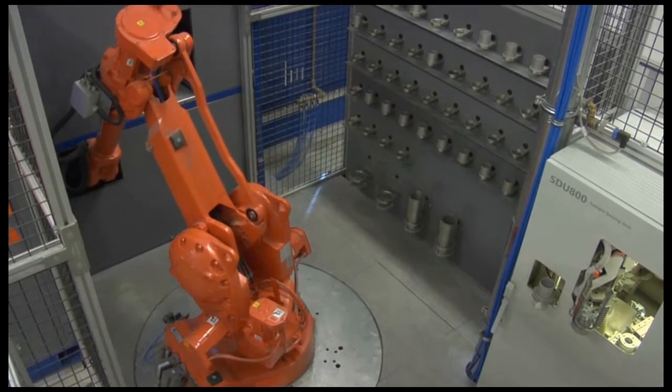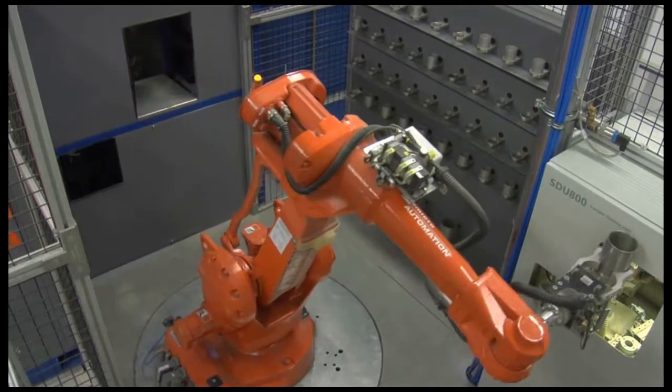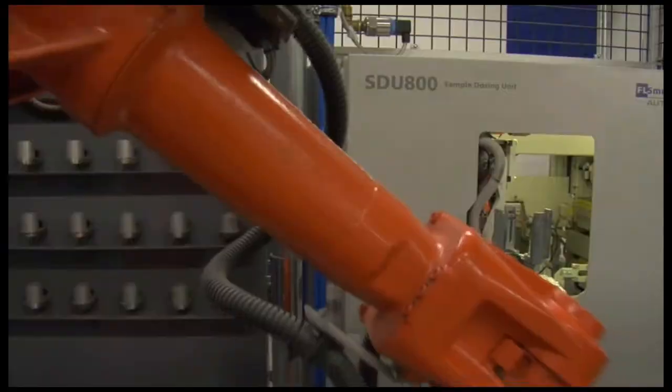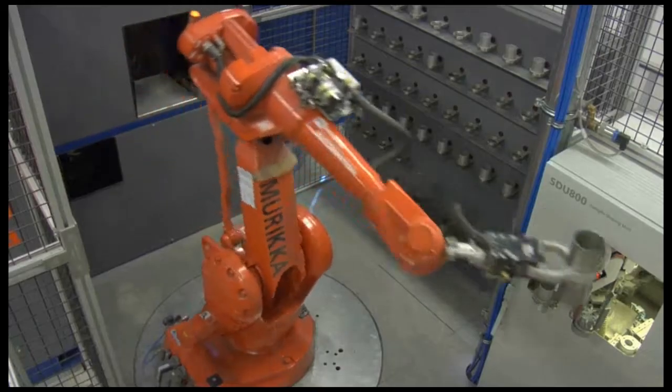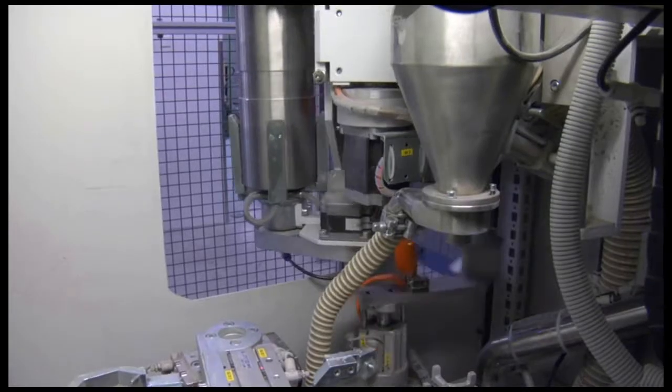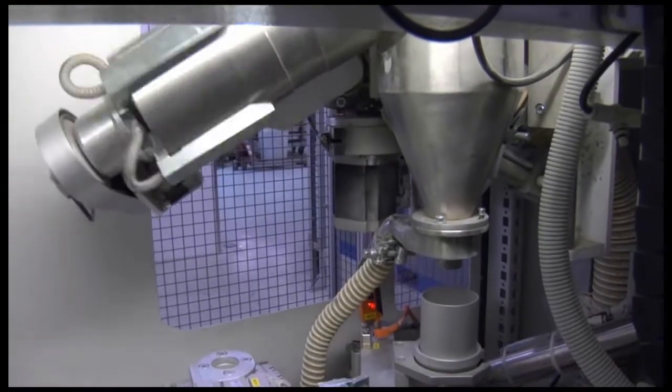The sample portion coming from the pulverizing cell is split into a large cup in the sample dosing cell. The dosing cell consists of one sample dosing unit and one fire assay doser. First, the sample goes to the sample dosing unit, where it is dosed into several sub-samples. One for further processing in the fire assay doser.